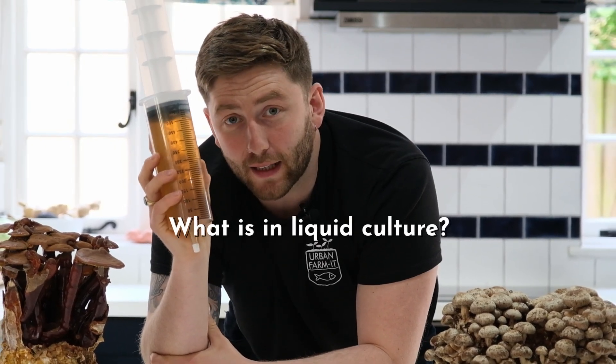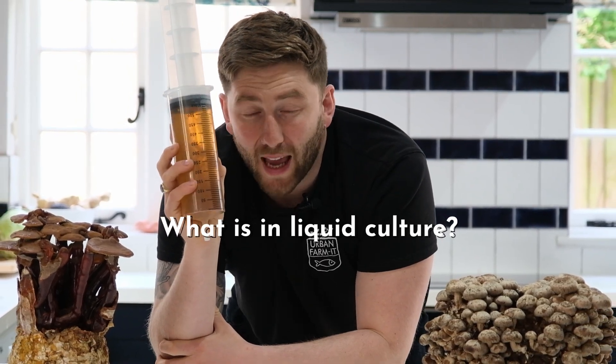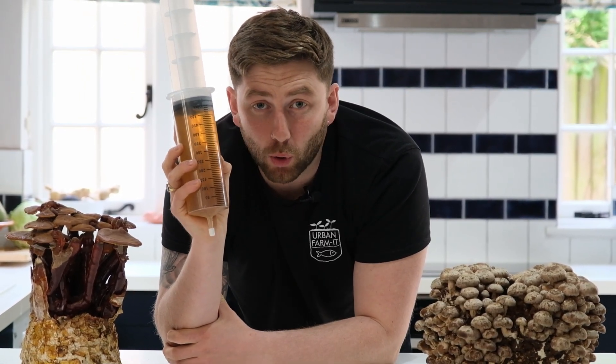Although this liquid culture right here has mycelium in it, you can also get liquid culture with spores in it. However, there are advantages and disadvantages to each. If you have spore-based liquid culture then you'll get much longer storage times. However, if you have mycelium-based liquid culture you can ensure a higher rate of success and faster inoculation.